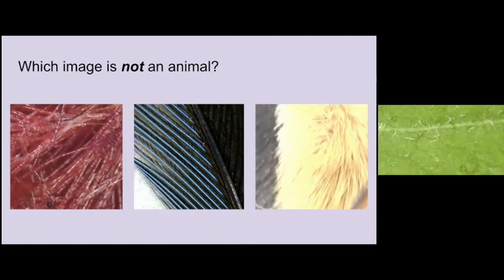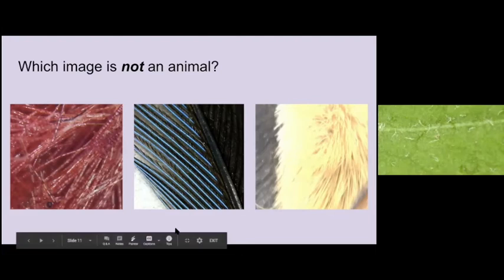It looks like it has lights. I'm looking super close. It looks like it has lights. That looks like it isn't. Does anyone else have anything? I think it's the second one that's not an animal. What are your thoughts? Which one do you think is not an animal?